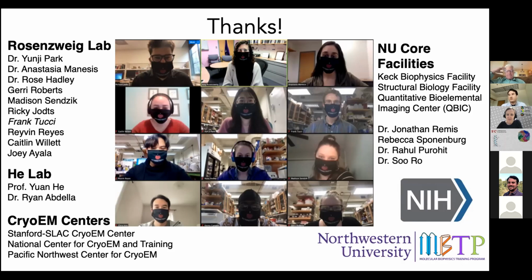So 3D classification was done using C1 symmetry. So it was all done in C1 and using the entire particle. So I didn't try anything beyond that to get that copper C class. And I wasn't sure if this is being asked, but those 3 C sites that I showed were actually from completely different samples of PMMO and from different data sets, essentially. So they weren't 3D classifications of one data set. They were different structures. Yeah. Exactly.